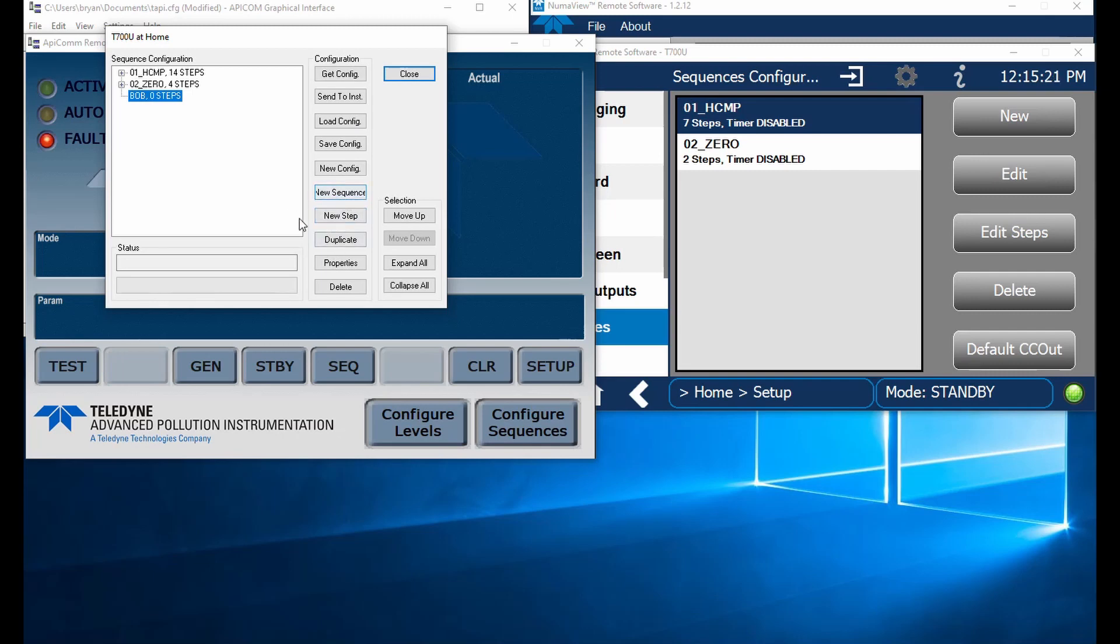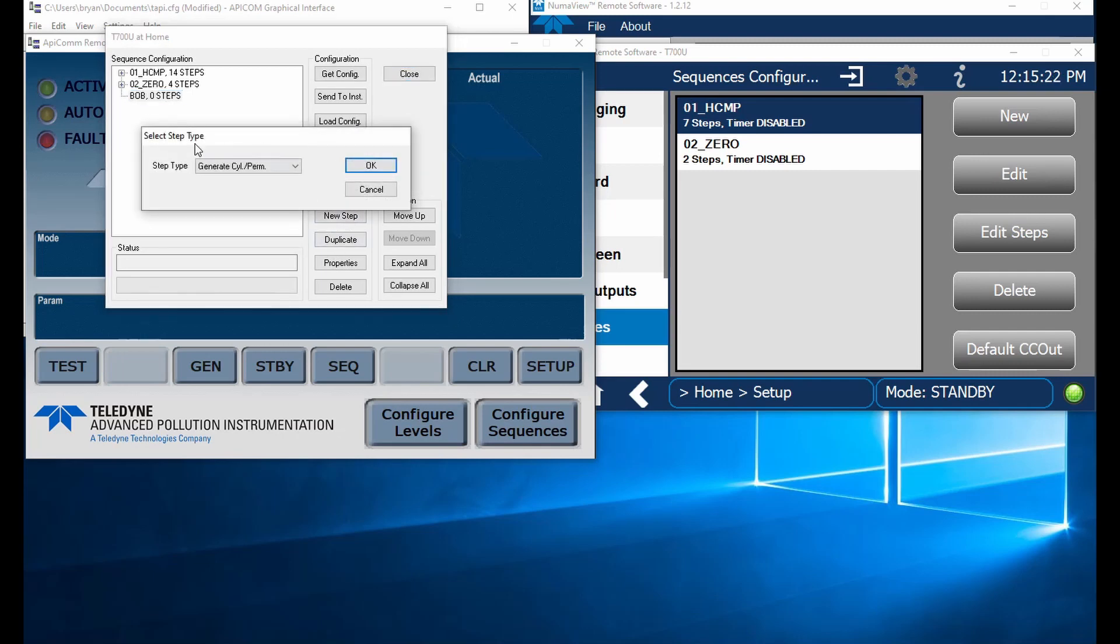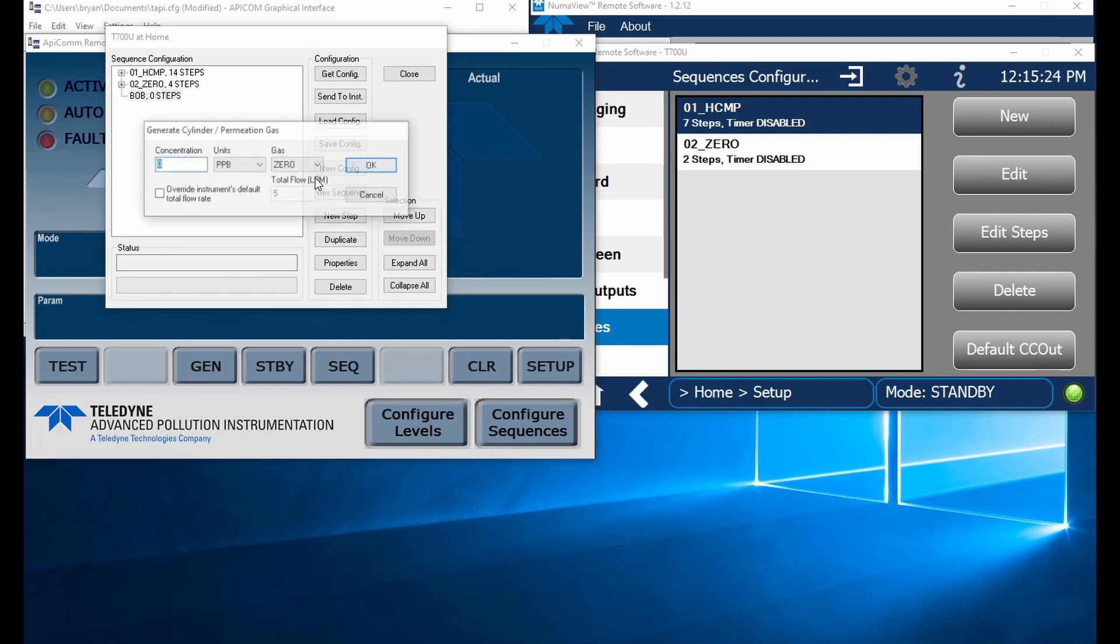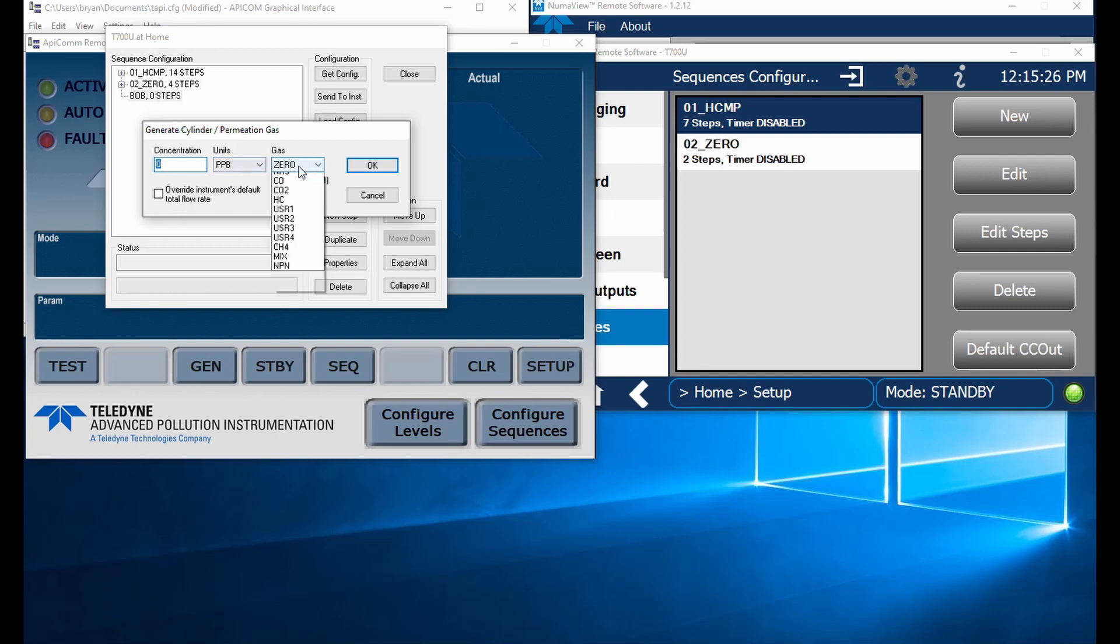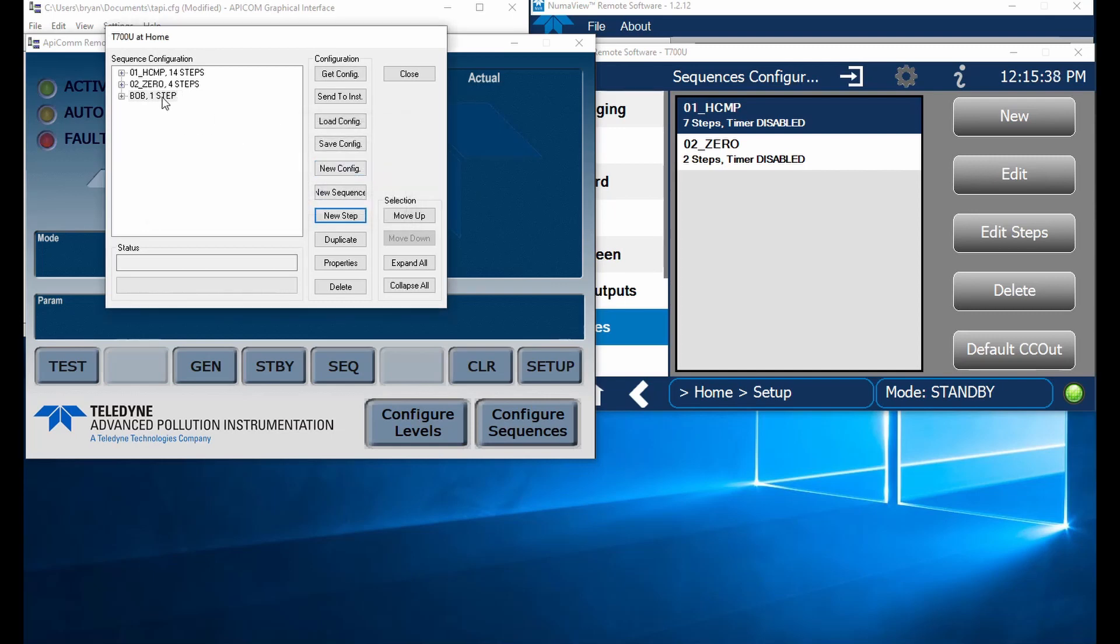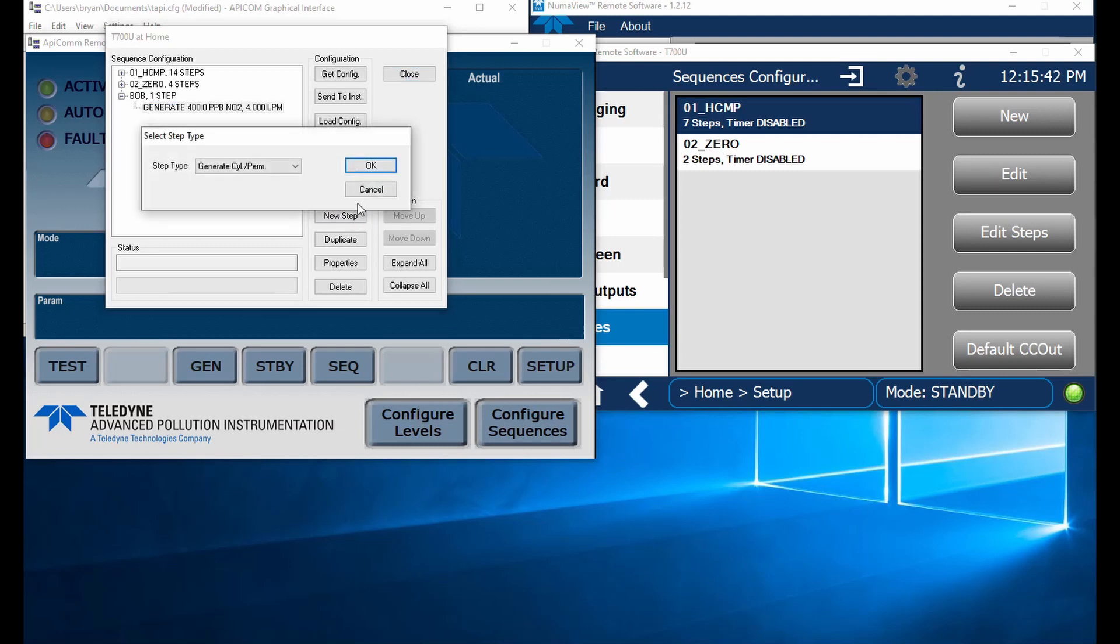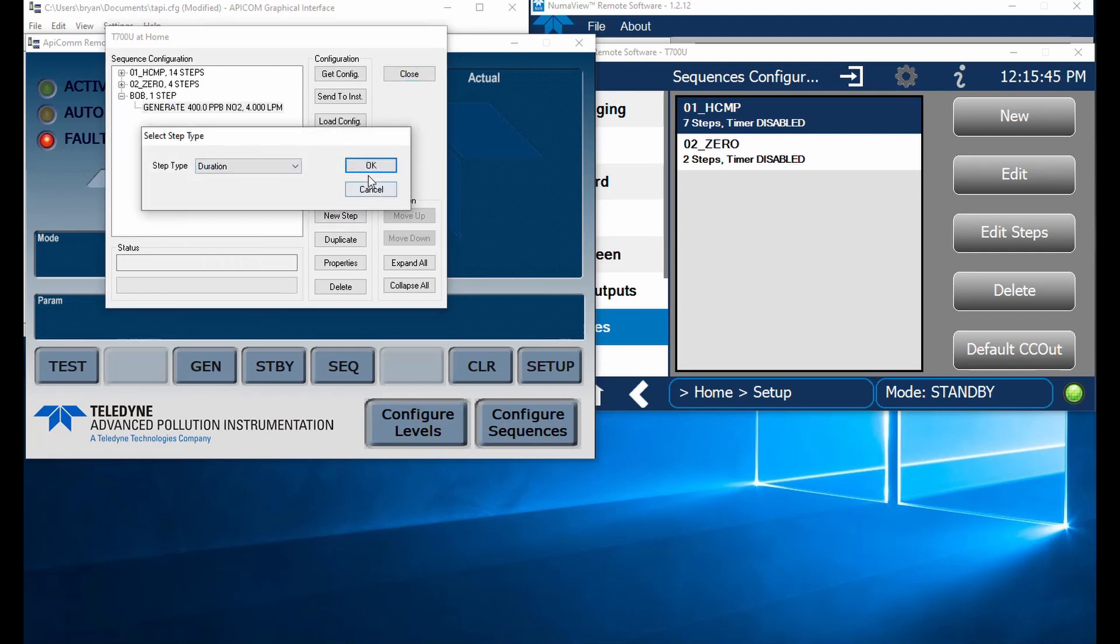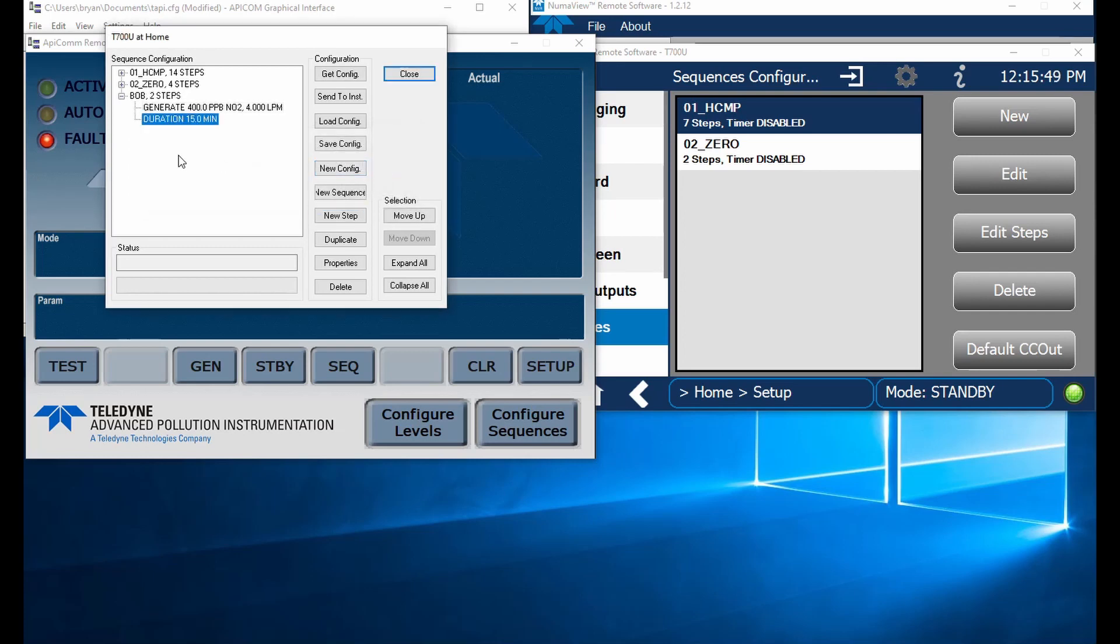Let's add a couple of steps. Let's say we're going to generate some NO. Let's generate some NO2. I've got an NO2 bottle in there at 400 parts per billion. Maybe I want to run that a little lower so we'll get rid of the default flow rate. So we've got one step. We've got to add our duration there. So we're going to throw in a duration step and let's put that at 15 minutes.